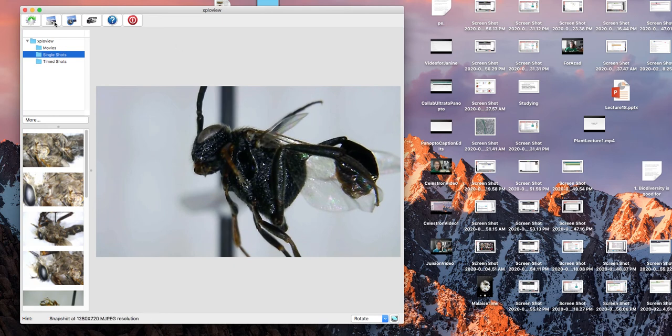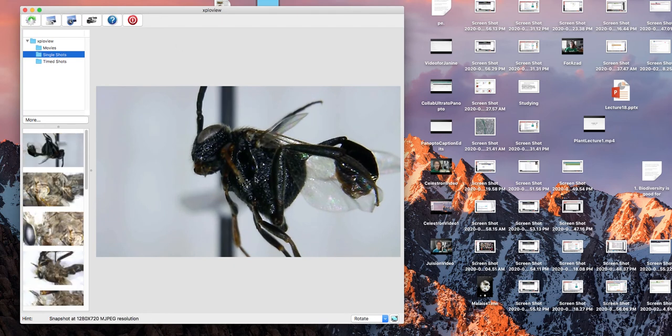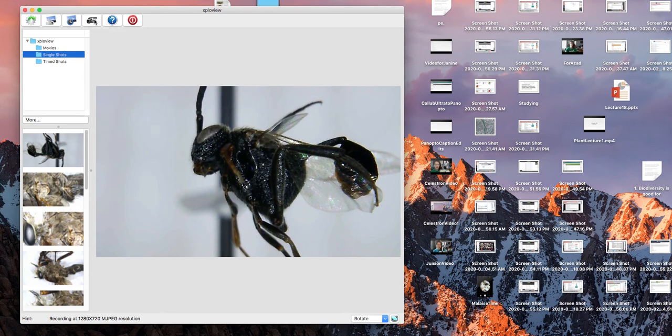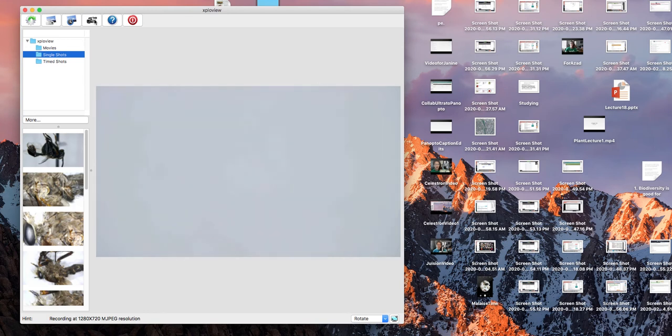Oh, and I didn't show you. This is actually how you take photos like that. You can also take videos. But again, I don't know if you're actually going to use this unless you're putting these images into a slideshow or something like that. I'm probably just going to open up this microscope as a camera in Zoom for the live sessions that I'm doing. So let's go with an even smaller insect.